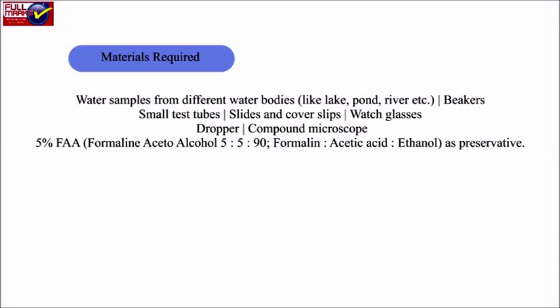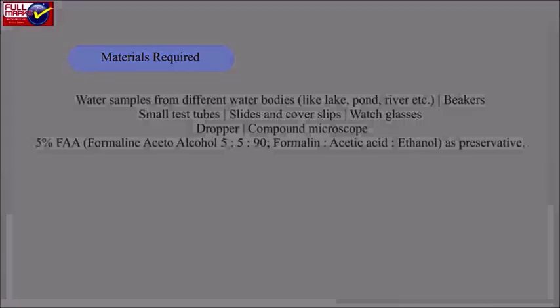Beakers, small test tubes, slides and cover slips, watch glasses, dropper, compound microscope, and 5% FAA, that is formalin acetoalcohol, in a ratio of 5:5:90, formalin to acetic acid to ethanol, as preservative.